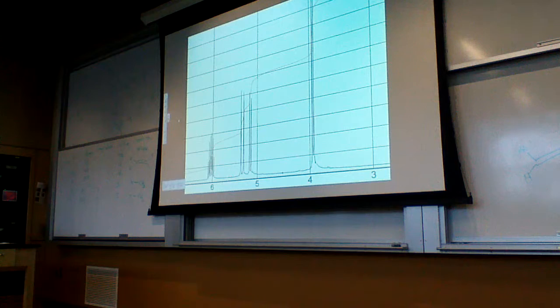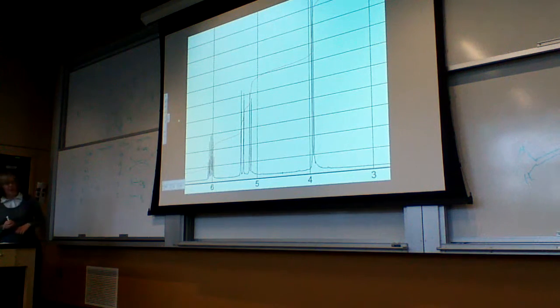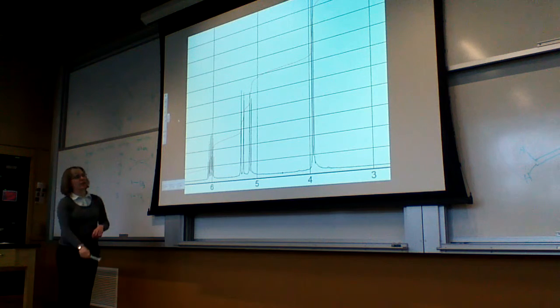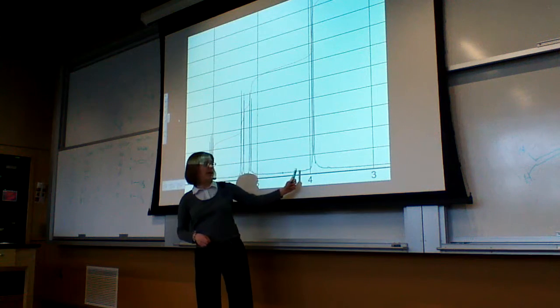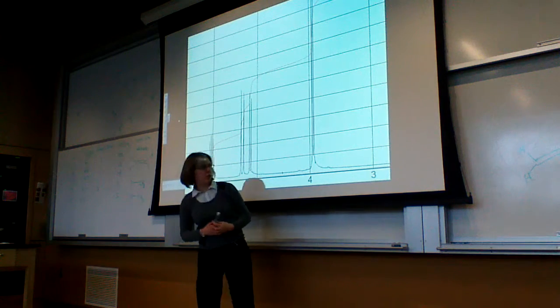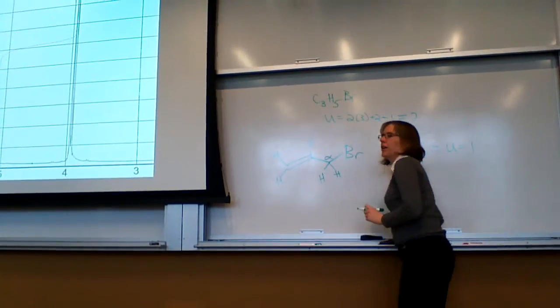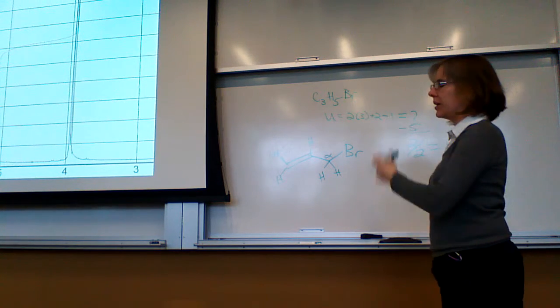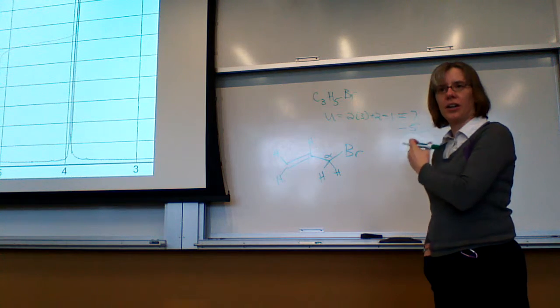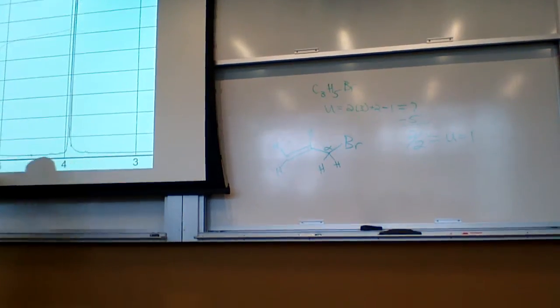Questions on that one? Anything else I want to say about that? That's about it. We already talked about alkenes. The chemical shift of the peak around 4 indicates that it's attached to something very electron withdrawing, and if it's alpha to an alkene, that will shift it up a little bit. Remember that alpha to an alkene would be the next carbon over from a functional group, so alkenes and aromatic rings and carbonyls are going to shift the peaks a little bit downfield to higher ppm.